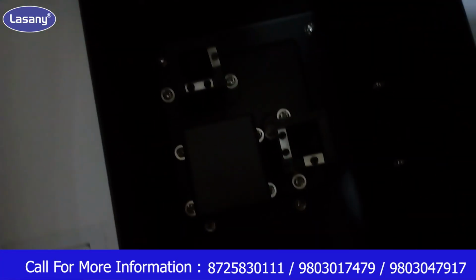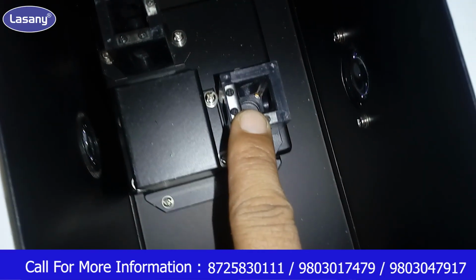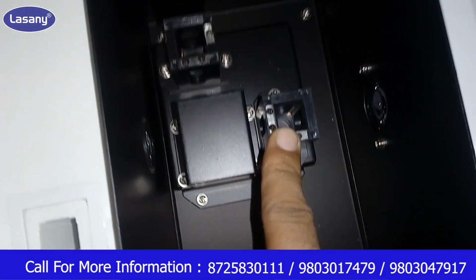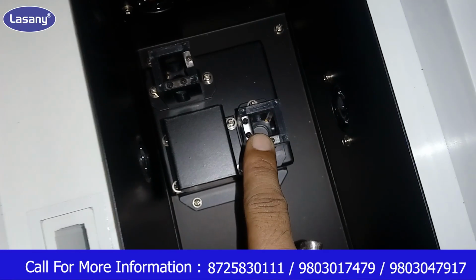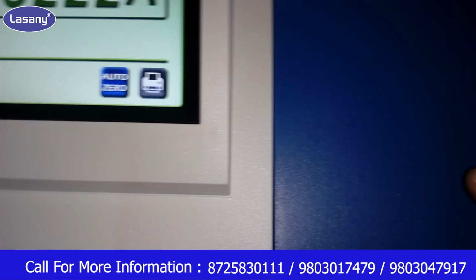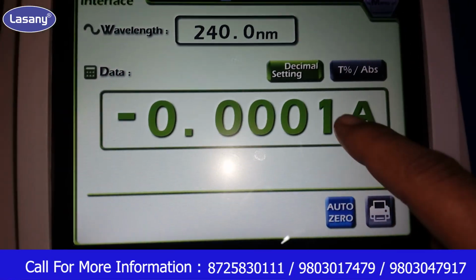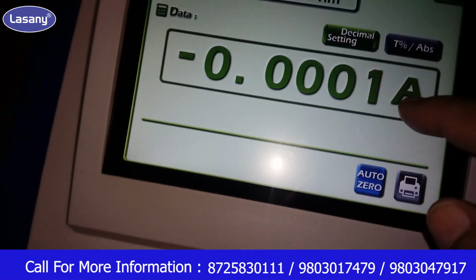After that, open this cell holder, remove your reference cell from here, and put in your sample to be tested. Just put in your sample and close the shutter. It will directly show you the results here. So this is how you can take the readings of any sample.